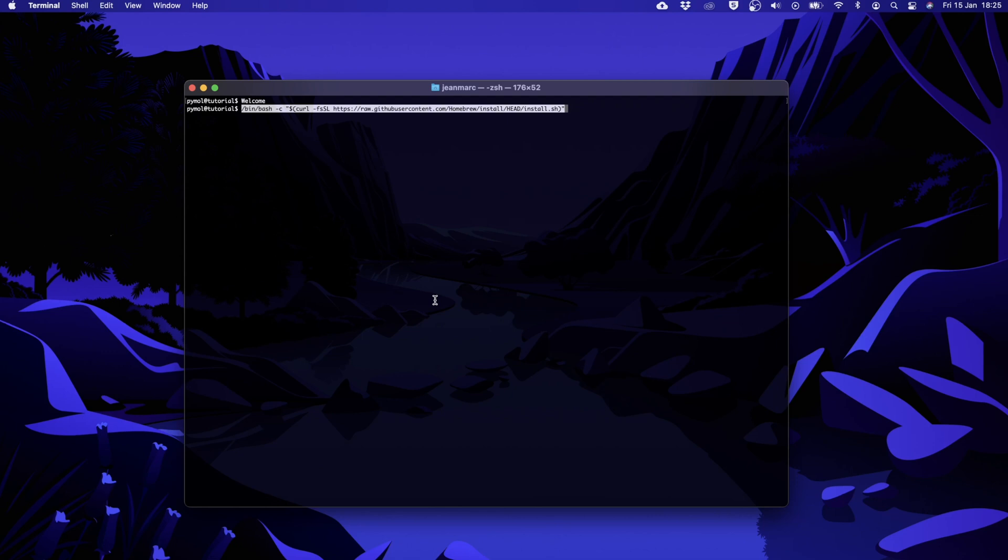To start the installation we just have to press enter. I'm not going to do it because homebrew is already installed on this Mac. The installation might take a couple of minutes.